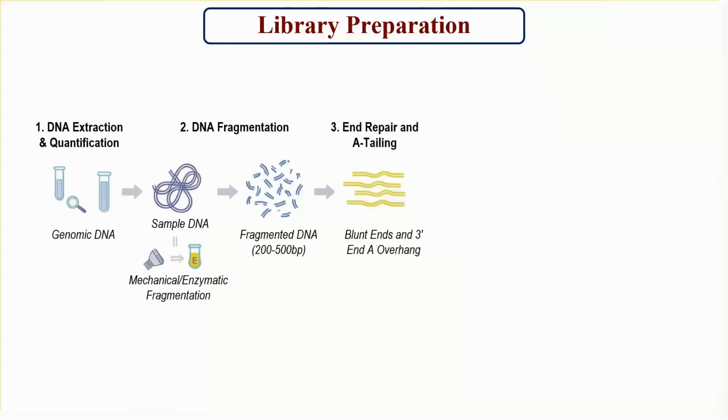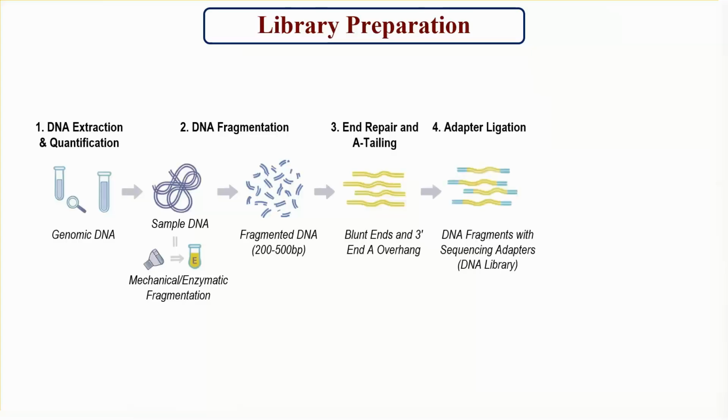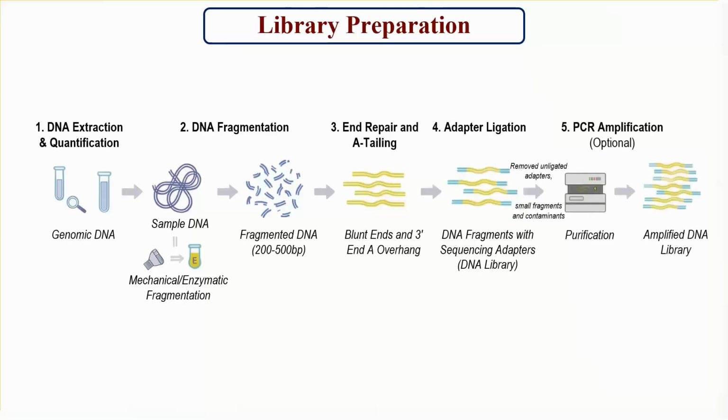Now comes a very important step, adapter ligation. Short synthetic DNA sequences called adapters are attached to both ends of each DNA fragment, resulting in a complete library. After adapter ligation, the DNA library is often purified. This removes unligated adapters, small fragments, and contaminants.